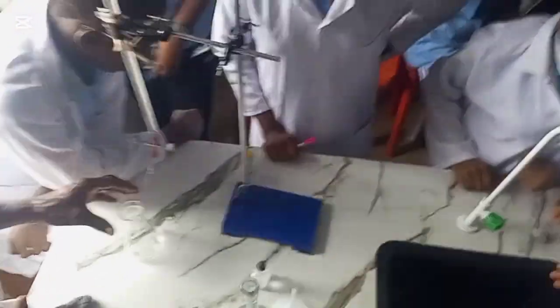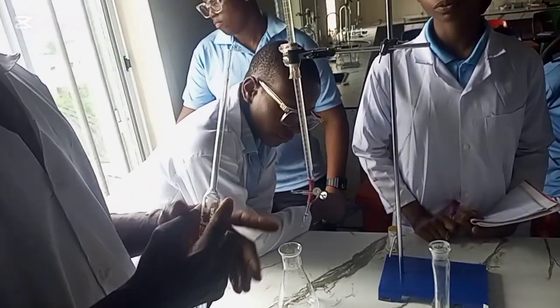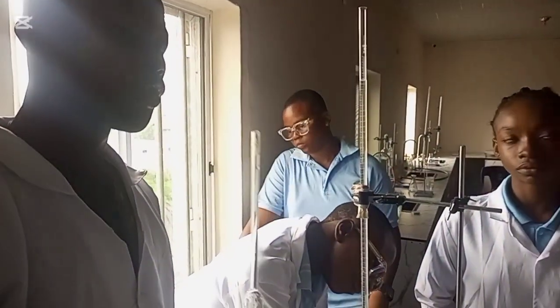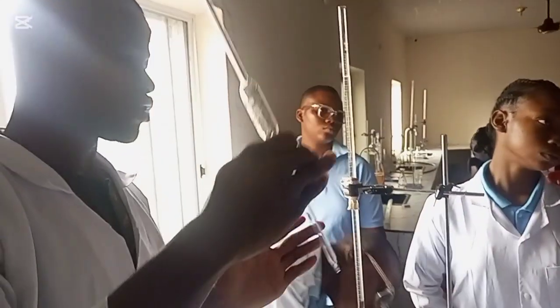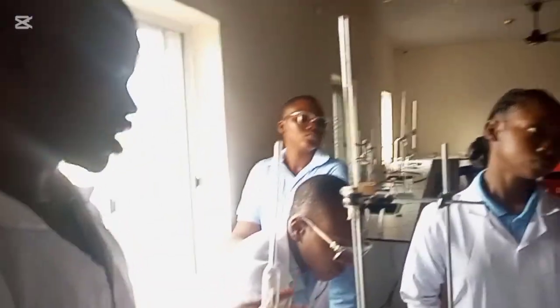The titration is done 3 times. We do it in order to get what we call concordant values. The concordant values are values that are close together, and then we get the average of those values. So we do the titration up to 3 times.